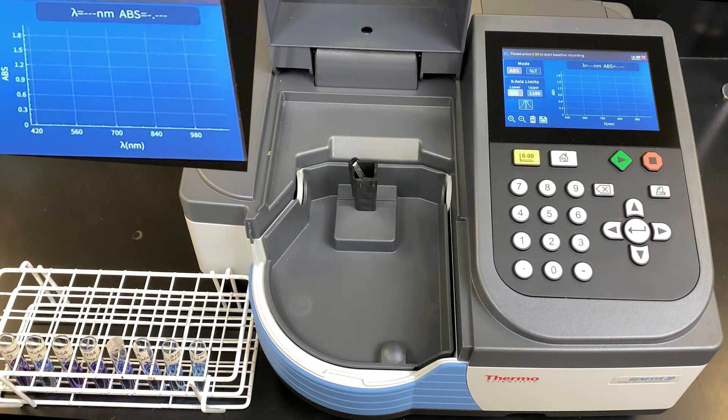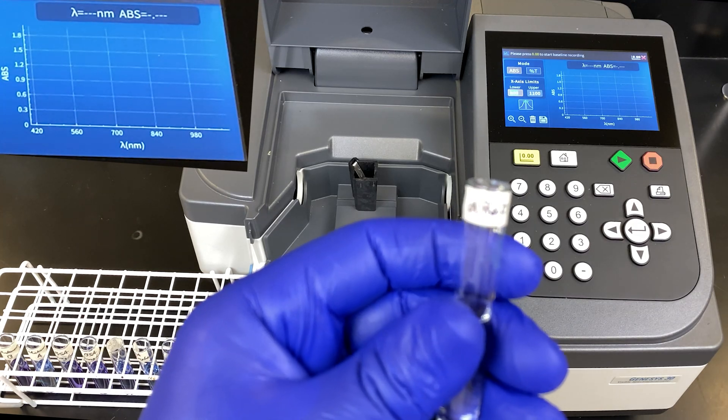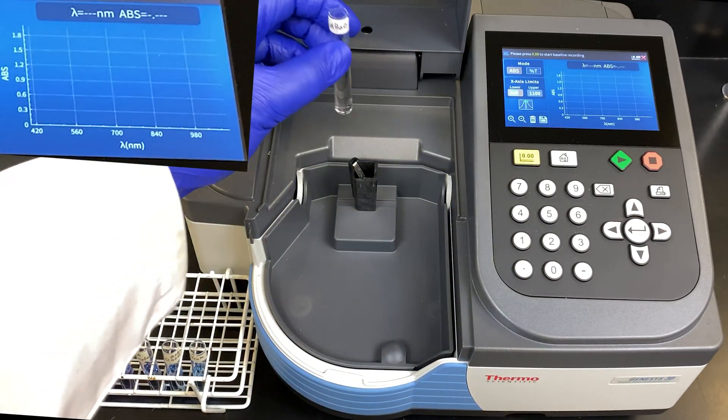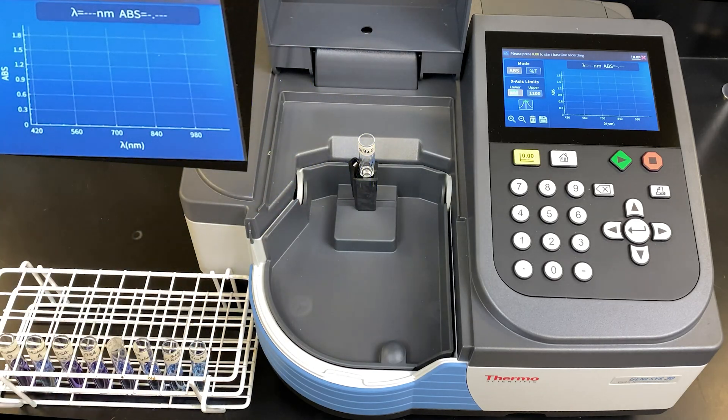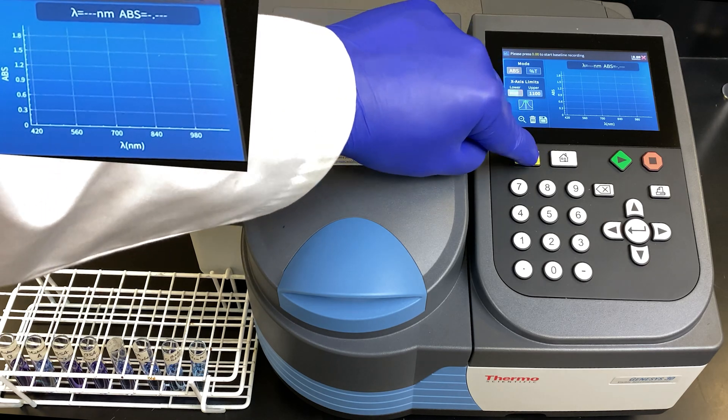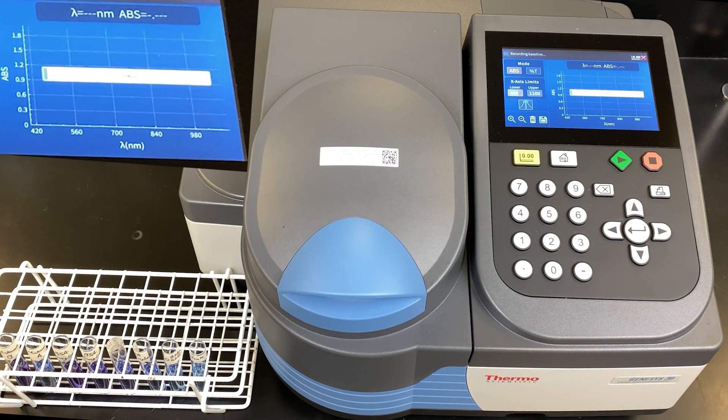We will begin with doing the automated scan on the Genesis 30 to determine what the Amax is. To do that, we will take our water sample to blank for the absorption spectrum, distilled water. Place it into the machine, close the door, and it says press the blank button. It is the yellow button. We press that, and it starts off.